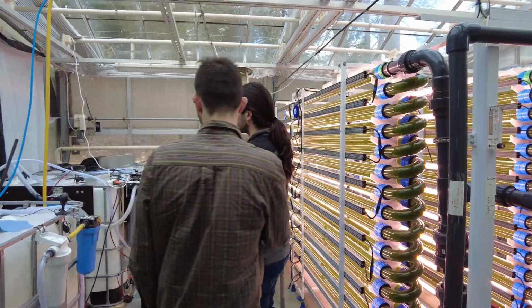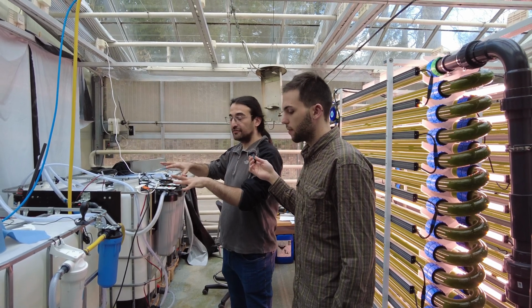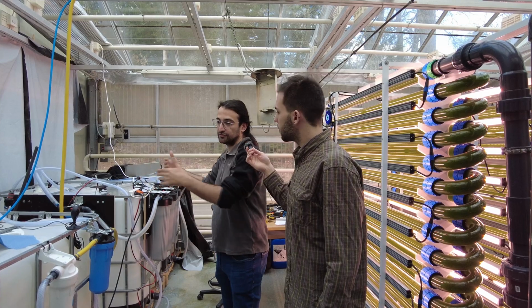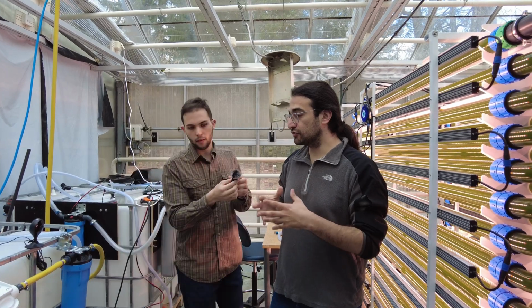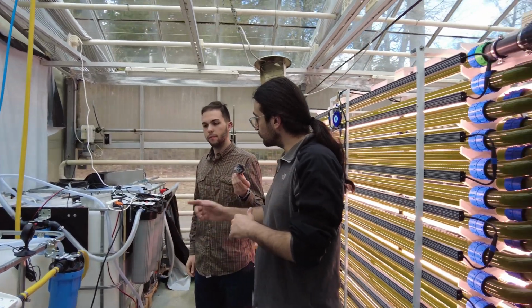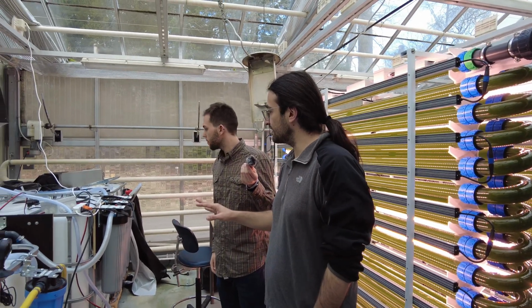The wastewater is coming from this side, and in those canisters we are storing it, and whenever we need, we are pumping the wastewater to our photobioreactor. I will say PBR afterwards. Before sending it, we have lots of compounds in wastewater, but we don't want to do so much pre-treatment. So you are seeing the filters, and we are only filtering it. We are not doing anything else.